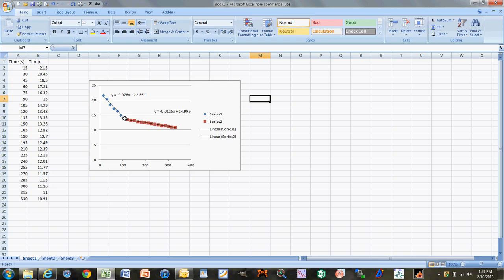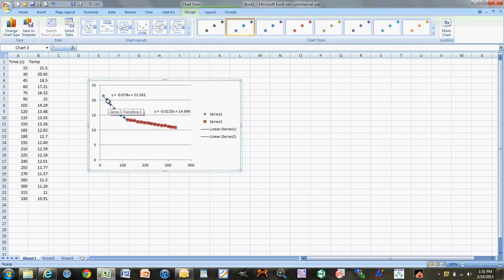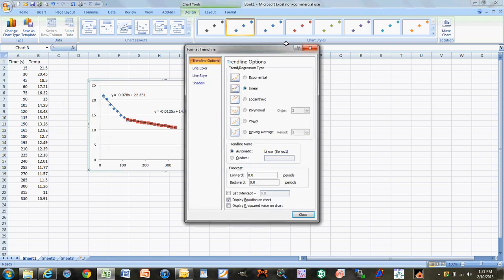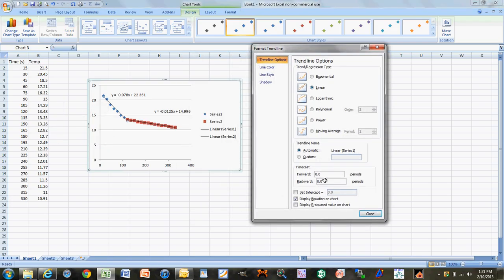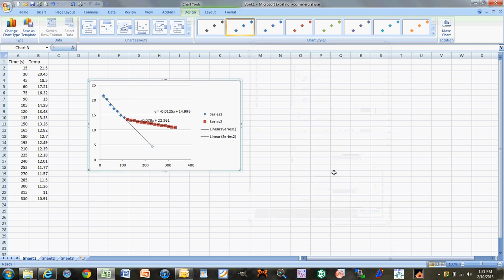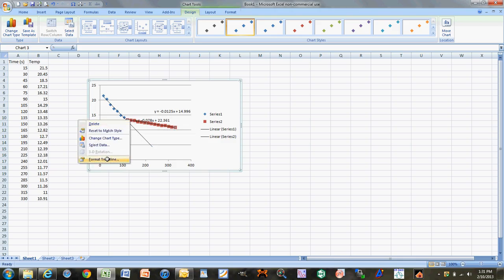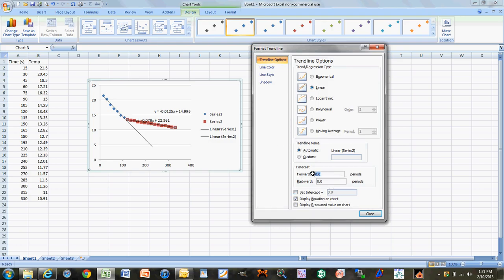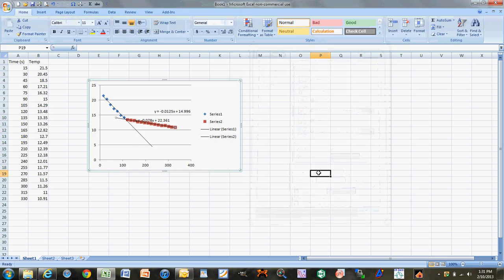If you want to make the graph look good, click on your trend line, right-click, and format the trend line. Go to Forecast, select to go forward, and set it to 110 periods — this extends the line out 110 more seconds. Do the same thing for the second trend line: right-click, format it, and forecast it backwards about 50 periods. That will make your graph look clean.